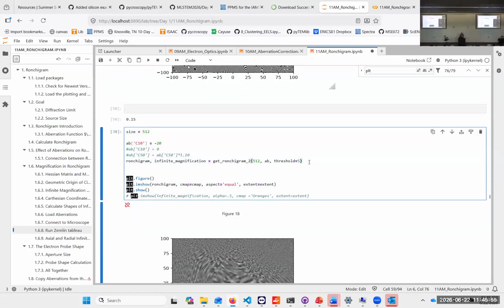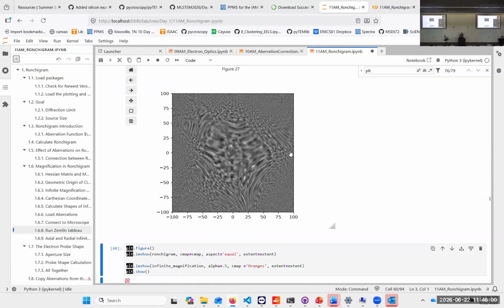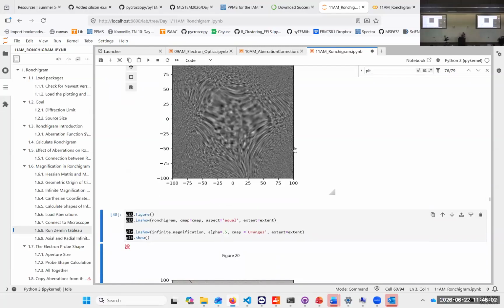I wanted to go and look at our microscope as well. So at 60 kV, of course, the aberrations are a little bit harder. You can change the defocus. And you can see already that on that aberration corrected microscopes, the angles are much larger, obviously, right?